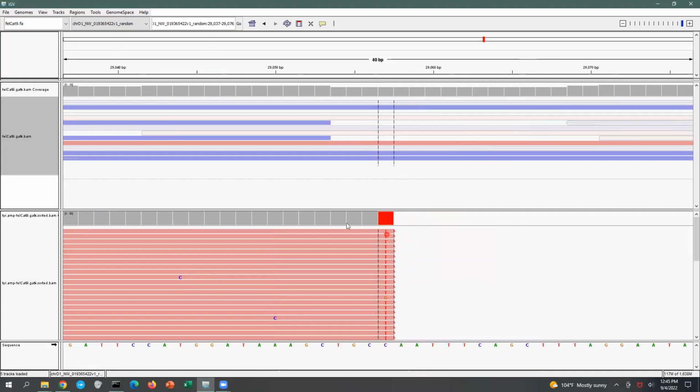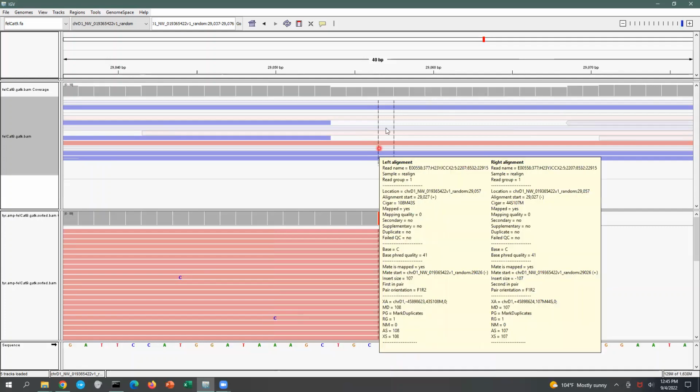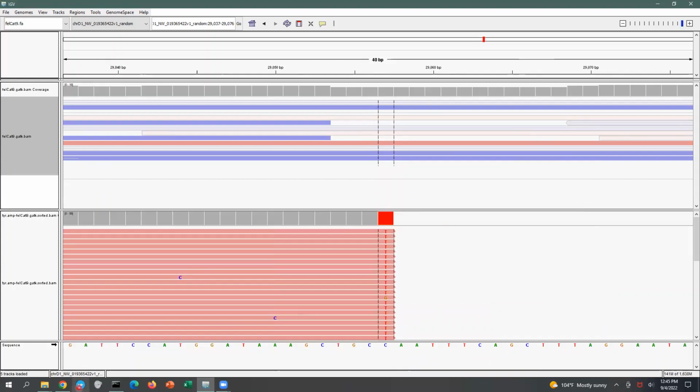And then you can see this gray bar turns into a red bar, and that is IGV's, I guess you might say, informal variant call, or it made some decision there was likely to be a variant there. And in each of the reads, there's a T. And so the T color is red. That's why this is red. If it was half red and half green, that'd be like you had T and A, and the reference was a C.